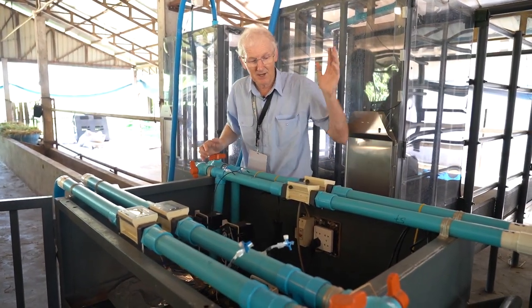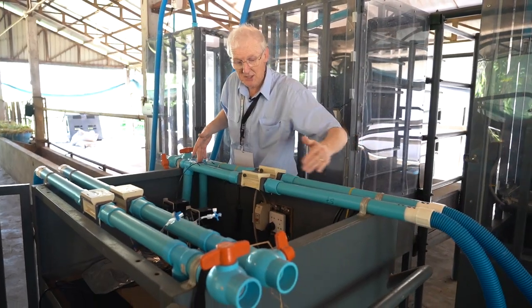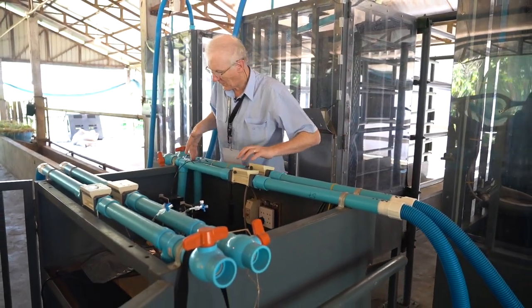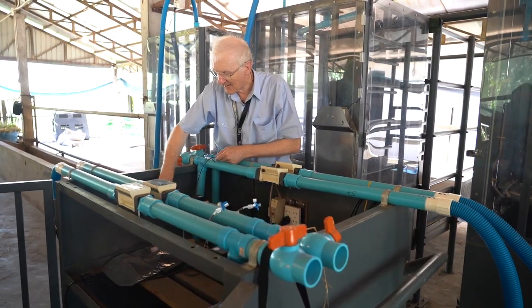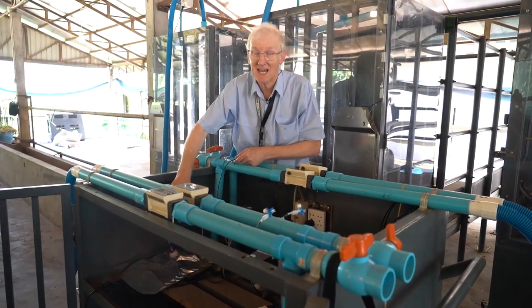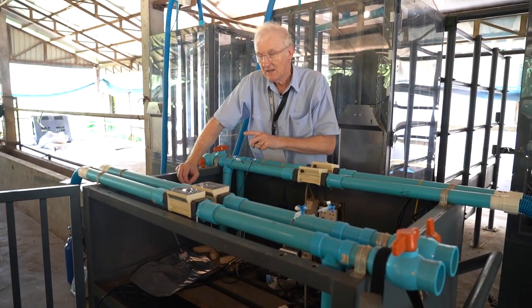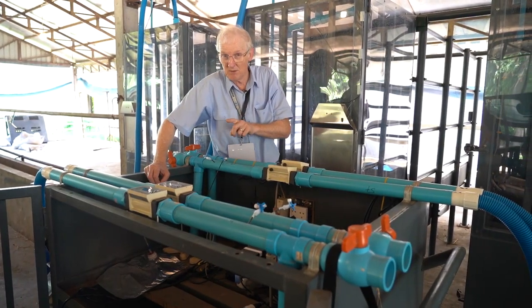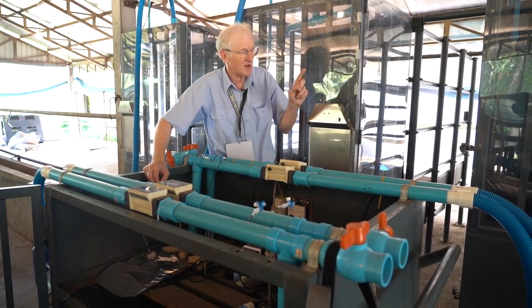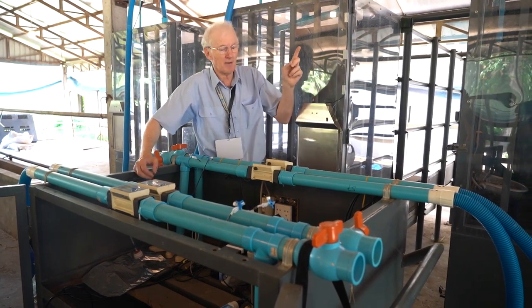So there's our components. The intake line, the correctly proportioned straight length of pipe, the flow meter, the sub-sampling point, the peristaltic pump, and the gas bag that we will collect and take and analyse tomorrow morning at the animal house. While I'm saying, I should say, it is just as important that you measure the methane concentration in the air that is going into the chamber as the air that is coming out.